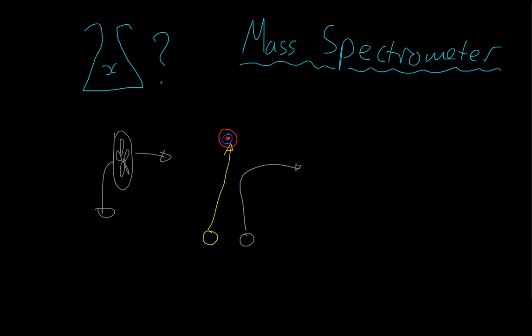Why is that? Well, the tennis ball is going to have higher mass. So this has a higher mass than this ping pong ball, which has a really low mass, which is why it's a ping pong ball. So, using this concept of things having high mass going through something trying to push away from it, and things with low mass being deflected, we can try and get molecules to be manipulated based on how much they weigh.